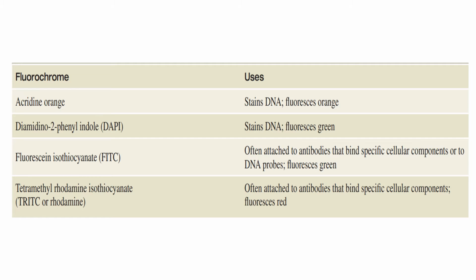Now, I hope the working, the parts and the principle of the microscope is crystal clear in your mind. But before going to the advantages of the microscope, I want you to get familiarized with what kind of names we come across when we are talking about fluorochromes, because I know you must have heard about methyl orange, a common stain in light microscopy. If you haven't heard, no problem. When we talk about stains in the staining series, we'll deal with every kind of stain, but just look at how fluorochrome stains sound.